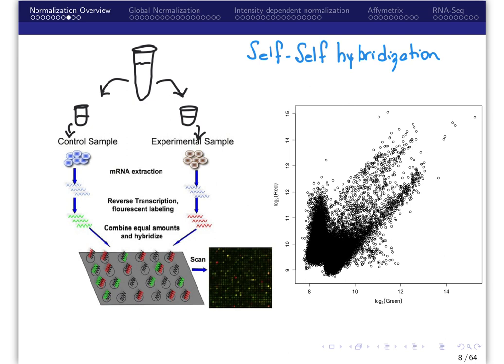Additionally, two samples, namely an experimental and reference sample, are labeled and hybridized to one chip. Differences in the labeling process, either due to unequal incorporation of the dye labels, unequal amounts of experimental and reference sample hybridized, or differences in the labeling efficiencies can also be a source of signal variability.